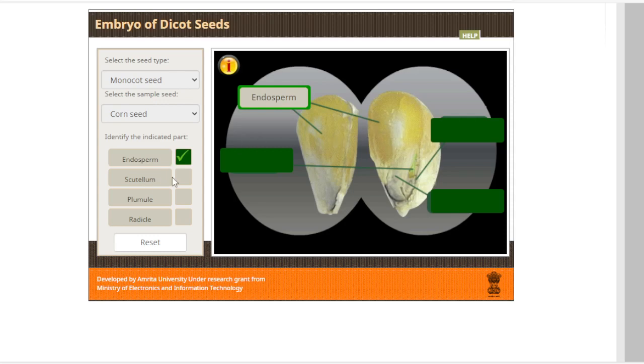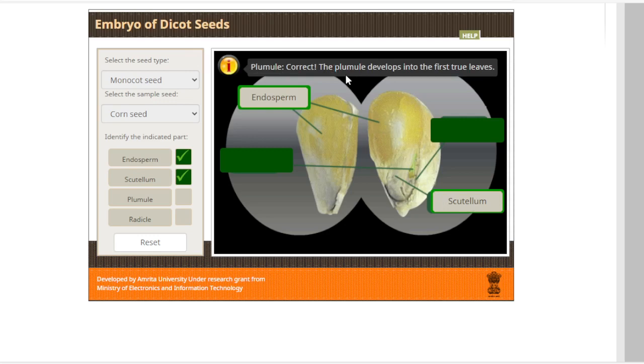Fine. Now we have got scutellum. Okay, that's very difficult to pronounce for me. तो ये कौन सा पार्ट है? स्क्यूटुलम है क्या ये? No. Okay, so this is the scutellum part. What is scutellum? Okay, no.